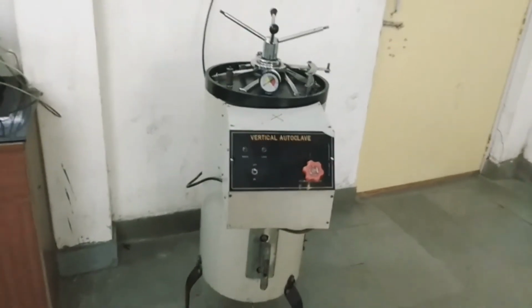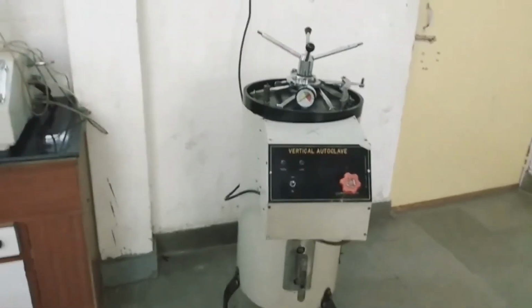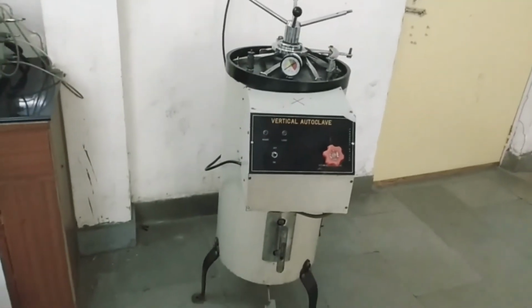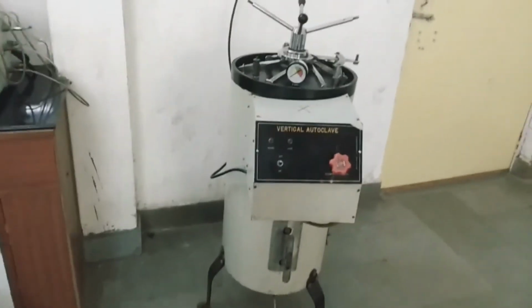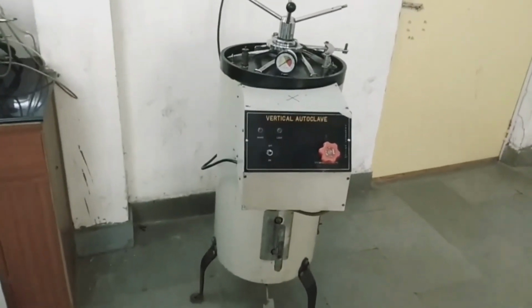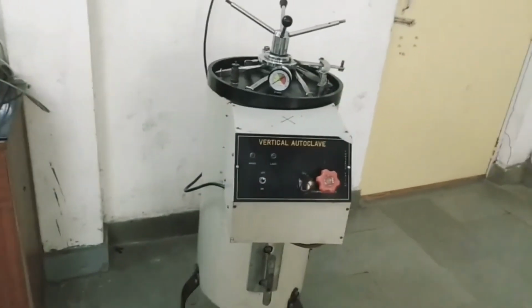Okay. Our fifth and the most important instrument is the autoclave. Autoclave is an instrument which is used in microbiology as well as biotechnology for sterilization purposes. Sterilization means we just have to remove contamination or any type of microbes in the culture media or any sample on which we are going to work. Okay, so this is the instrument which works on steam under pressure. That's the principle of it.